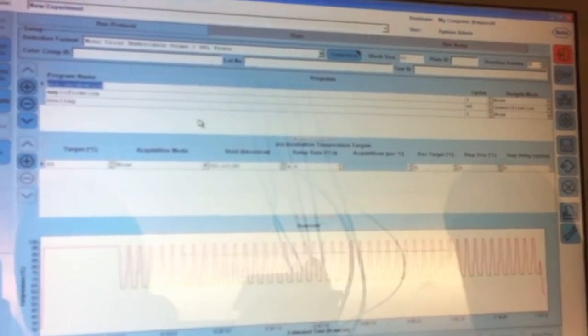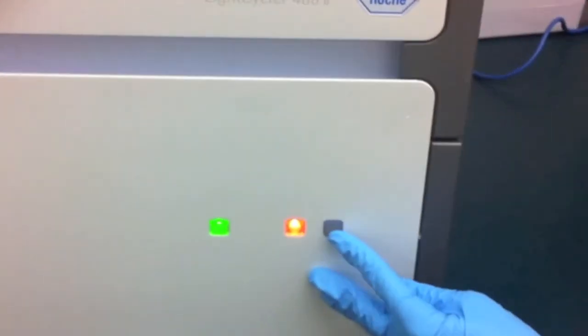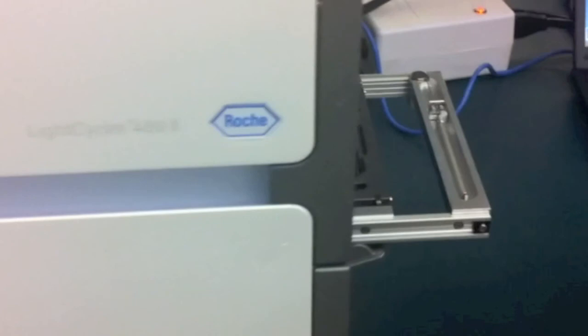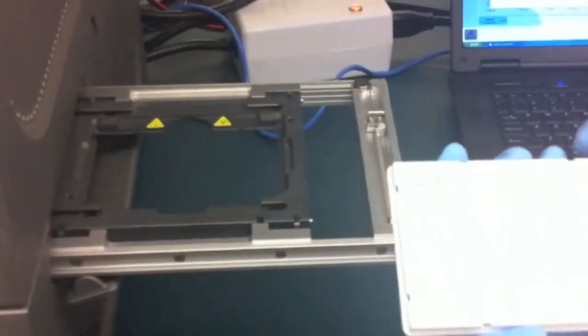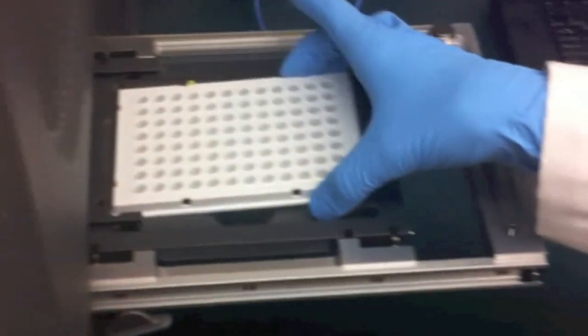Then, go ahead and load your plate into the machine by pushing the button on the side of the machine. Place your plate in the correct way by having the cut corner in the lower right-hand side.